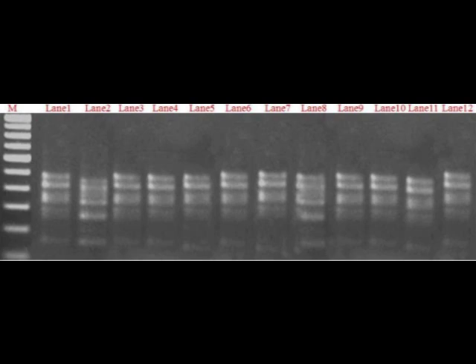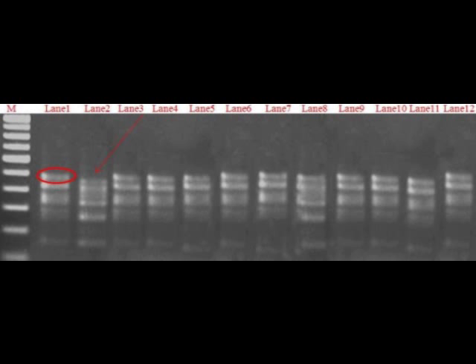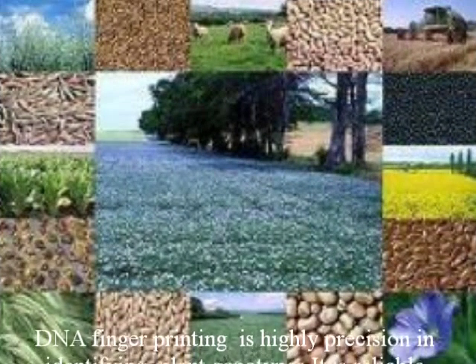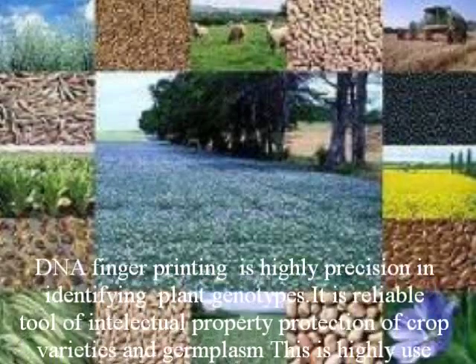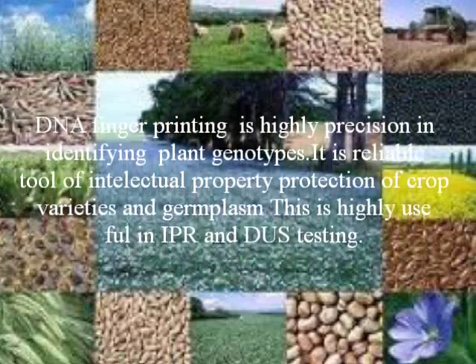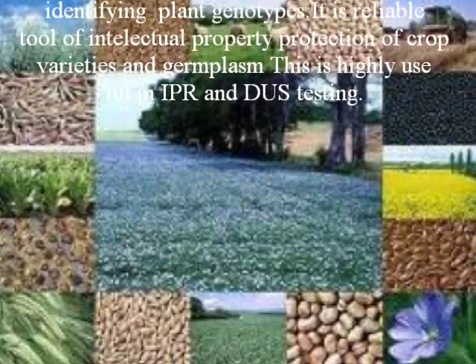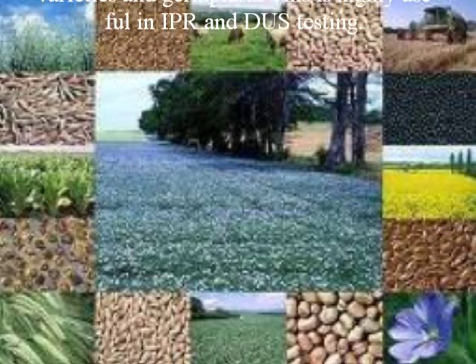Presence of a RAPD band corresponds to a dominant allele, against absence of a band that corresponds to a recessive allele. Absence of a particular RAPD band in lane 2 shows the polymorphism of the variety. DNA fingerprinting is highly precise in identifying plant genotypes. It is a reliable tool for intellectual property protection of crop varieties and germplasm, and is highly useful in IPR and DUS testing.